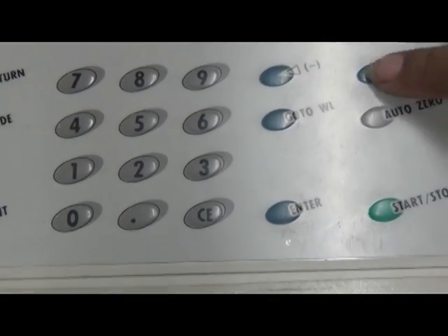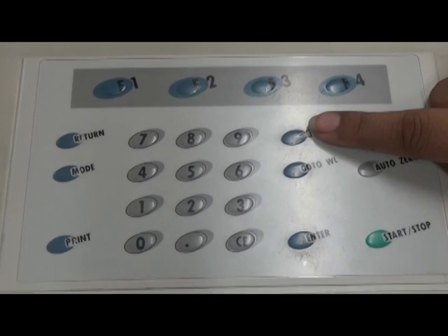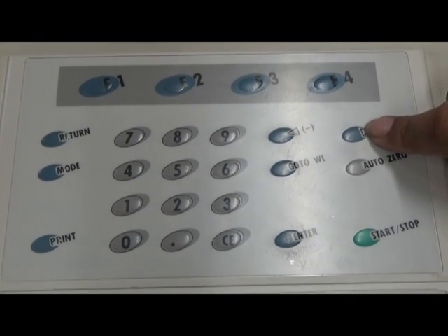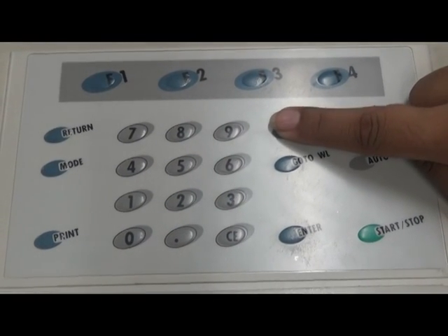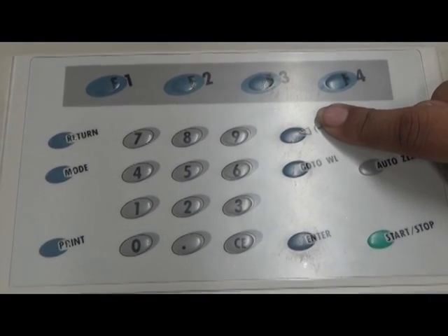This is called the cursor key. Use this key to move the cursor on the LCD screen left to right. The left cursor key can also be used to enter a negative value when entering numeric values.